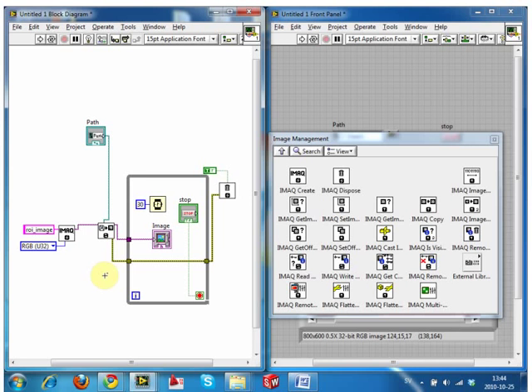No, but I mean, when it reads the image, is it in the loop? This place, yes. Exactly. But you have to connect the trash bin before it does this. Which is the functioning button here? I mean, is it here where it reads the image, or is it here? There. Here. Ah, okay, then it makes sense. I thought it was the other one.